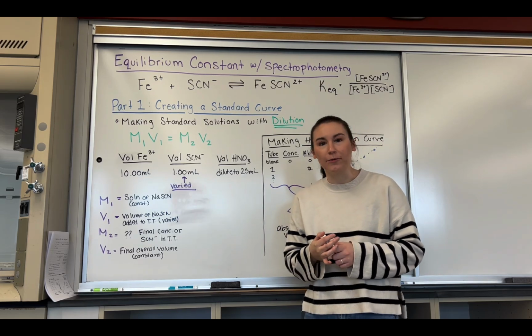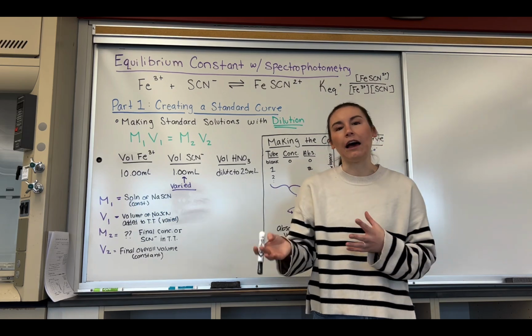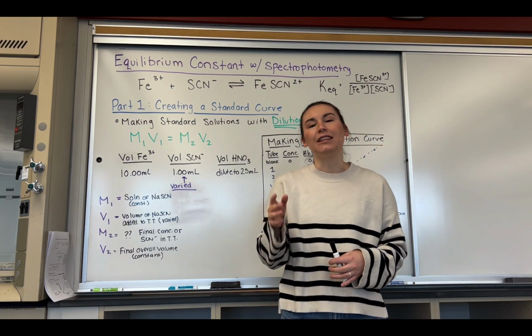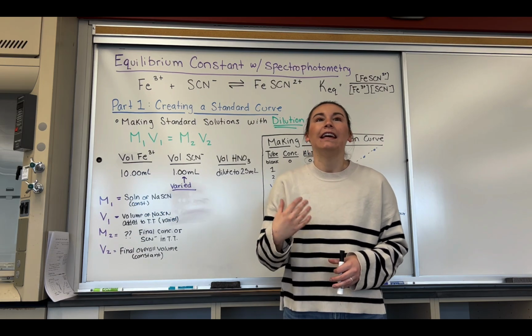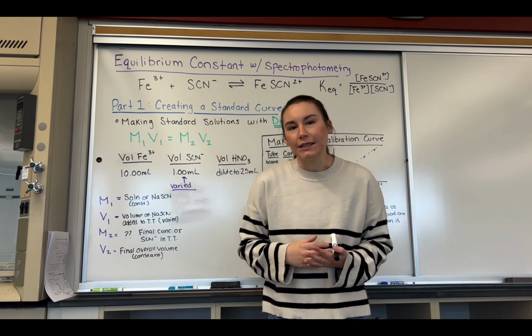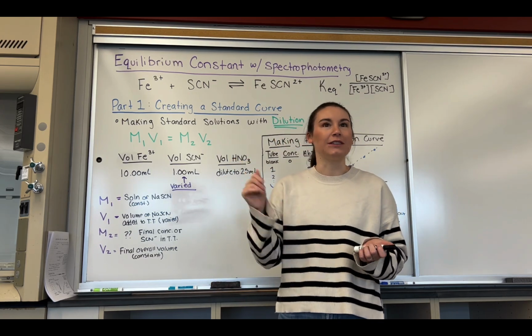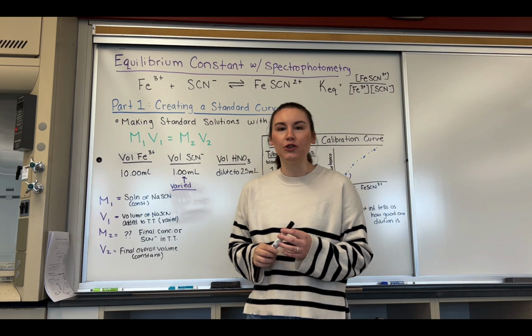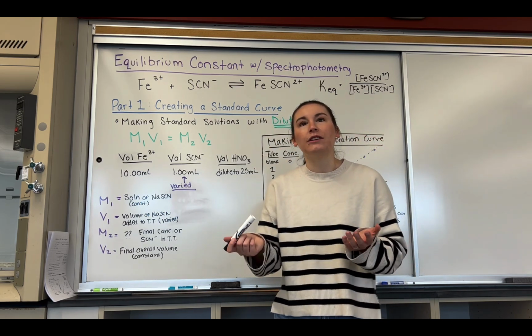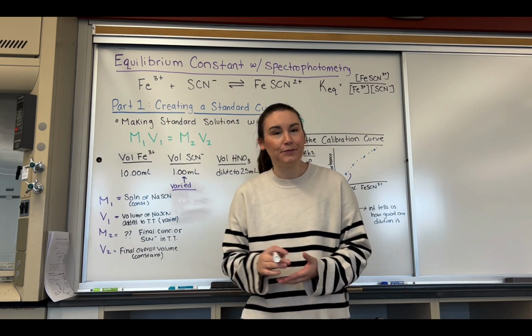Now, if you're doing the lab virtually, I will say that the experimental portion in LabFlow is not as built up as our previous labs, so there's no data that you are going to be recording. Instead, LabFlow is going to say, do you want some provisional data? And you're going to say, yes, I do. It'll say, are you sure? And you're going to say, yes, I do, because Dr. Burns gave me permission to do that. And you're going to essentially be given fake data that was already pre-recorded for you.